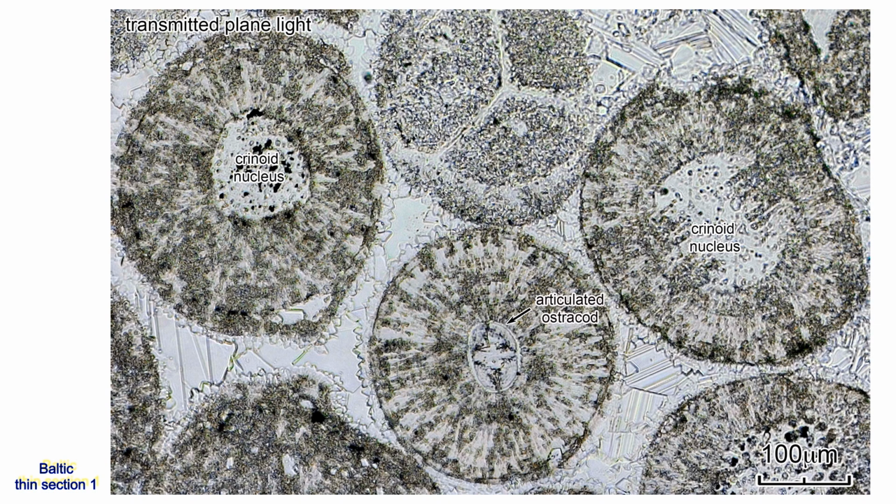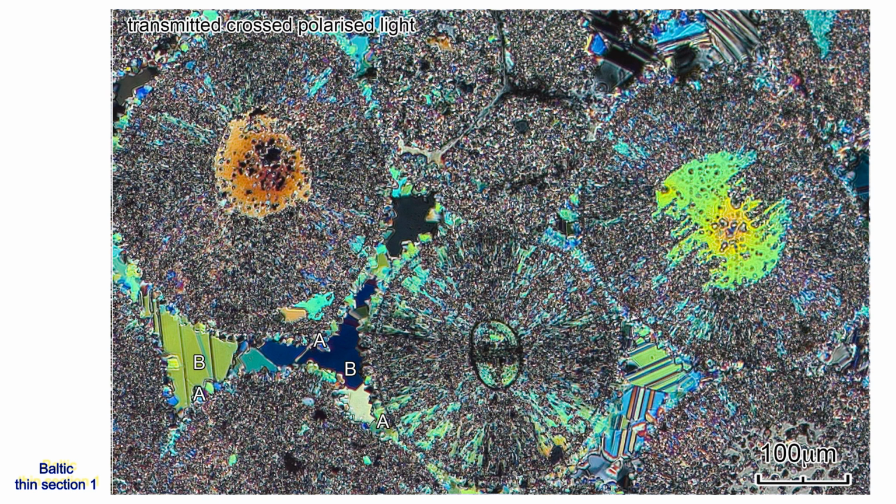The intergranular pores between the ooids are filled with 2 generations of calcite cement. On the cross-polars image, the early fringe of 10-micron-sized crystals is labeled A, and the later cement composed of 100-micron-sized crystals is labeled B. A bulge at the base of the left ooid, by the red asterisk, is composed of 2 calcite crystals. This odd feature is more extensively developed in 2 ooids from this section, enlarged next.